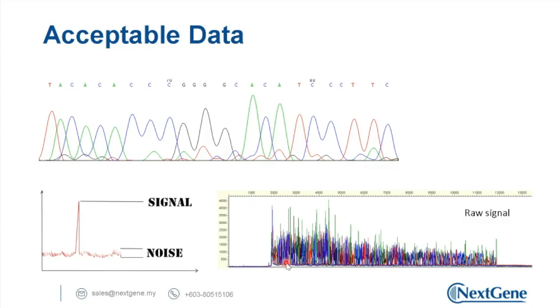Because your technology is actually using one primer at one time, right? So when we give you two reverse primers, you will do the same DNA template two times. That's why, if the first one succeeded and the signal is normal, more than 500, the second one should work because the template is enough.